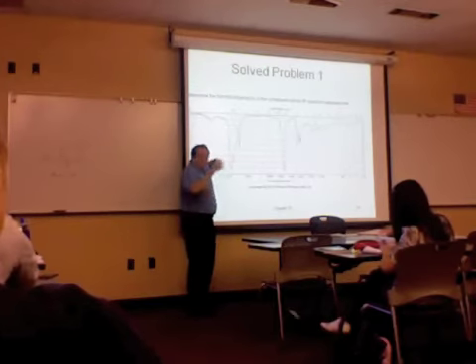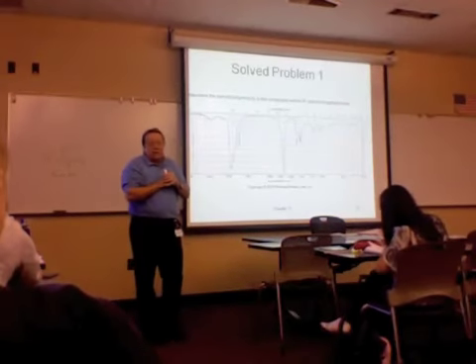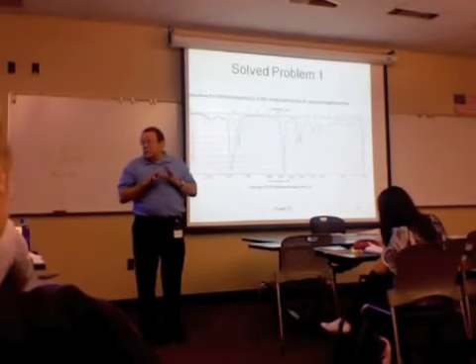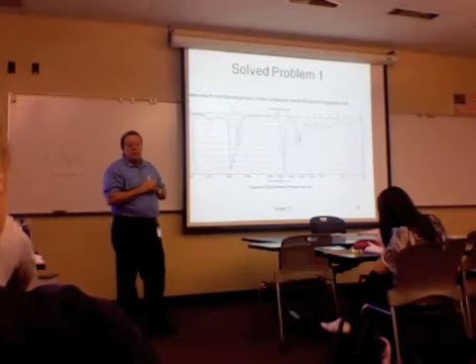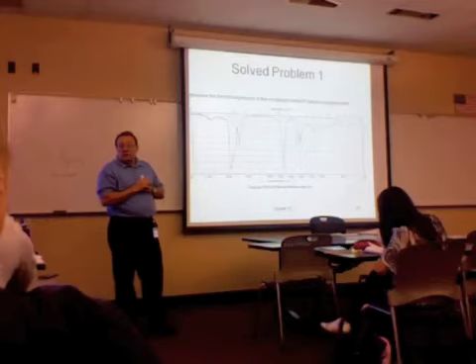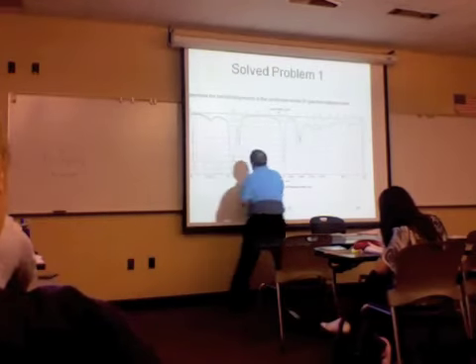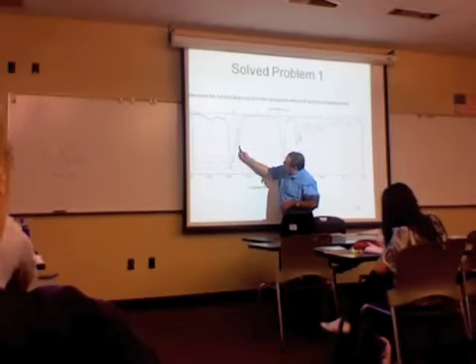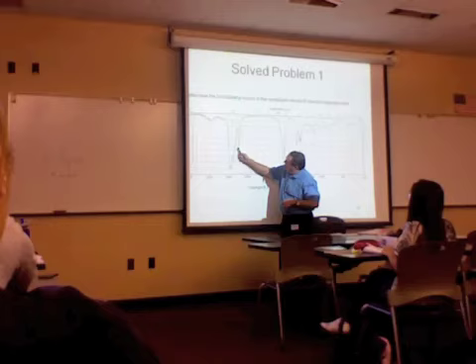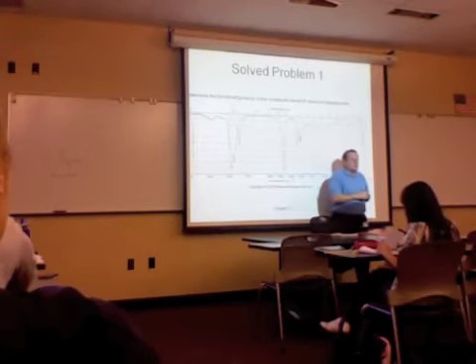Remember that the hydrogens on the nitrogen of an amide are out there, look very much like an amine, and we don't see any evidence of that. So we're down at this point to either a ketone or an aldehyde. True? Yeah. So what do I look for? Here's 2500, here's 2600, here's 2700. Just above 2700 I have a peak. Just above 2800 I have a peak. What does that suggest to us?